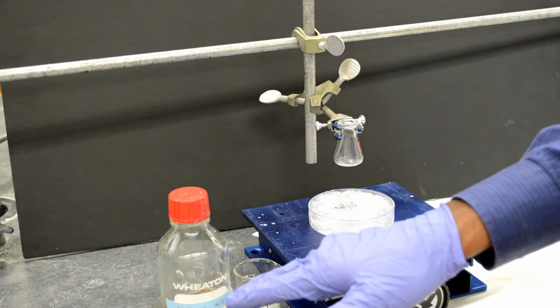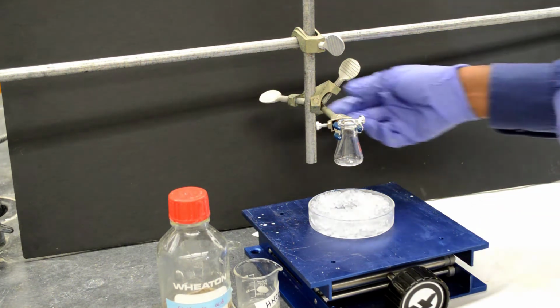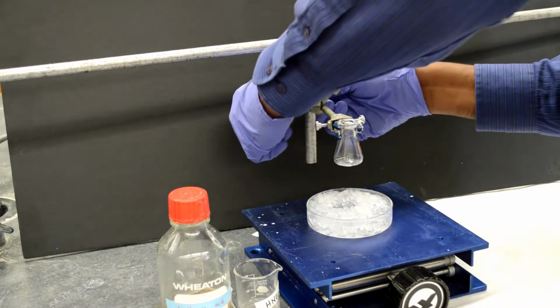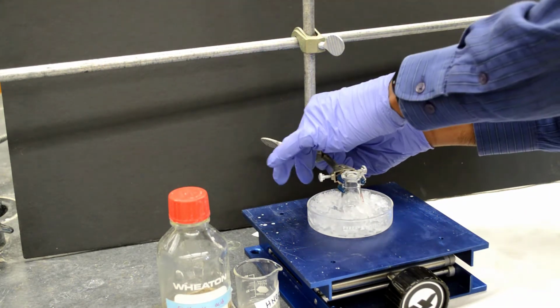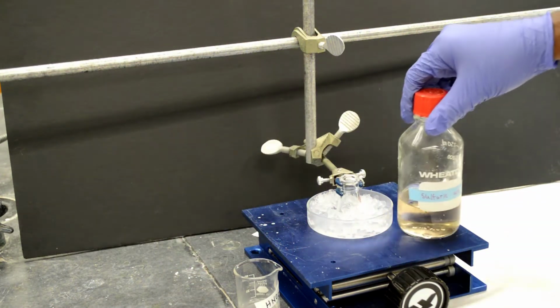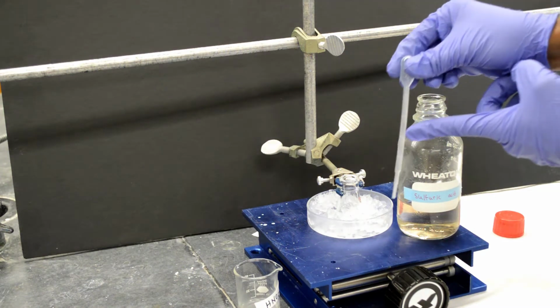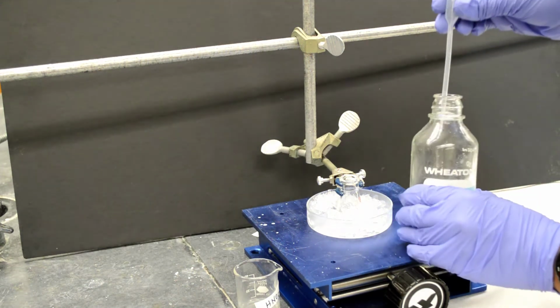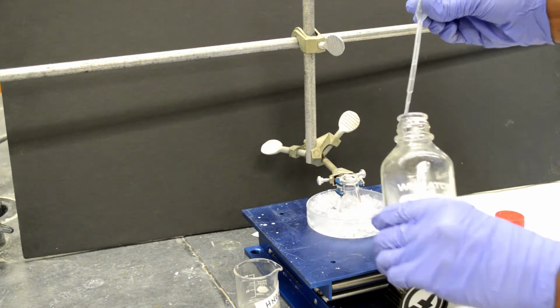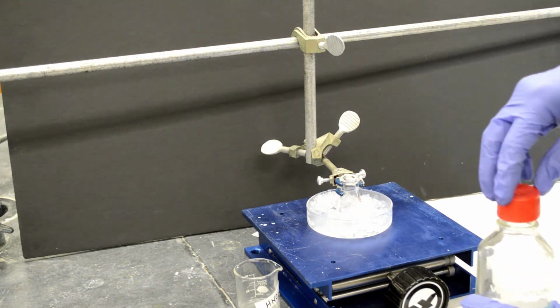This reaction could be exothermic. Adding two concentrated acids could be an exothermic reaction. So we need to keep that mixture in an ice bath to contain the heat. So lower this into an ice bath, and add half a ml of sulfuric acid first. It is a plastic tubing. This much is half a ml. Sulfuric acid.